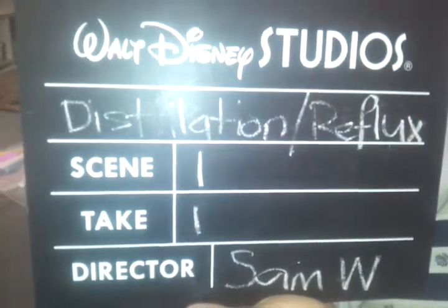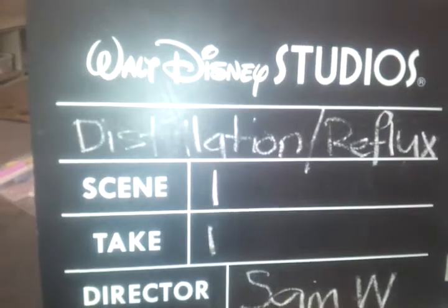Distillation and Reflux, Scene 1, Take 1, directed by me.